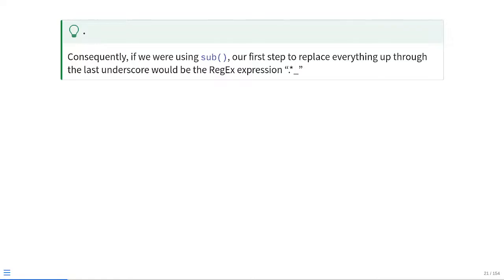So what sub actually requires when it comes to detecting and eliminating a pattern is what's known as a regular expression, also known as a regex in short.